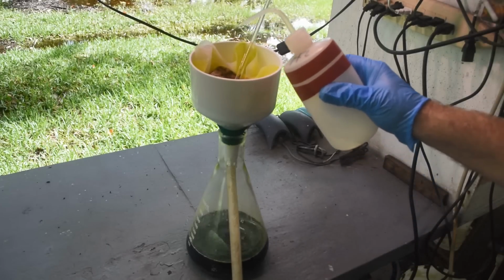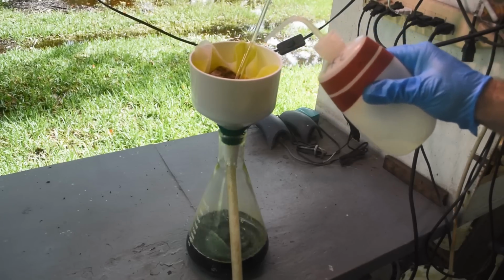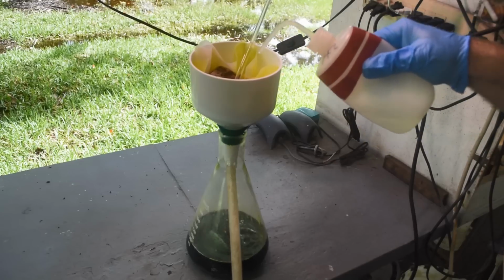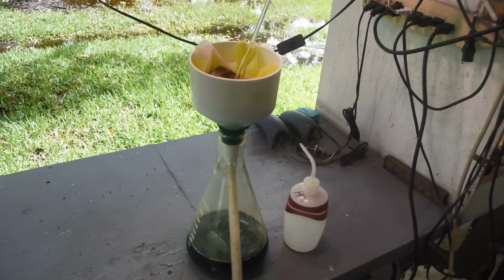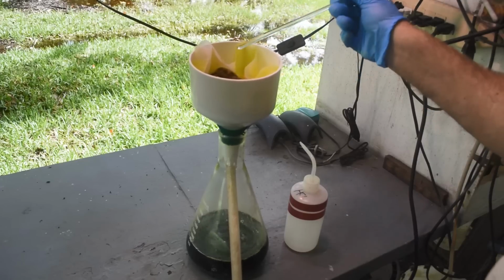Okay, I've run a lot of hydrochloric acid through here. This stuff's looking a lot less green. I think I've got a lot of the base metal salts out of it, the nickel, the copper. I'm sure there's still some, but it's certainly a lot cleaner than it was before I gave it this bath. So I'm pretty happy with that. I'm just going to let it sit here for, I don't know, 10-15 minutes. Let the vacuum pull the liquid off of it until we've got something that's semi-dry. And then we'll figure out where to go from there.